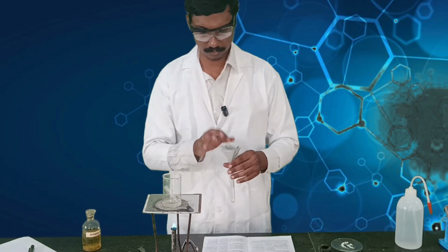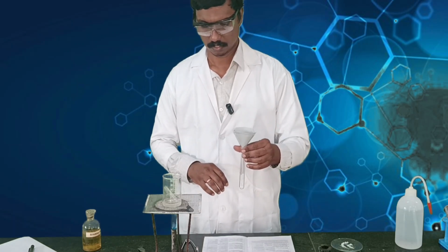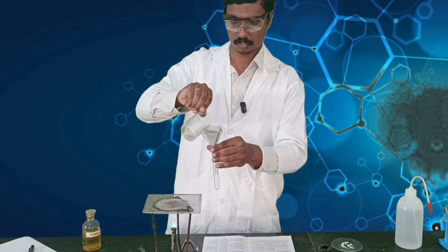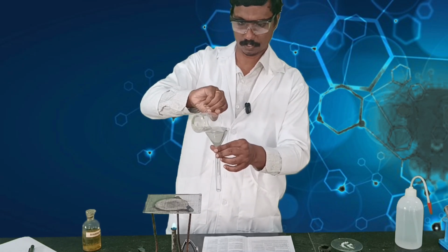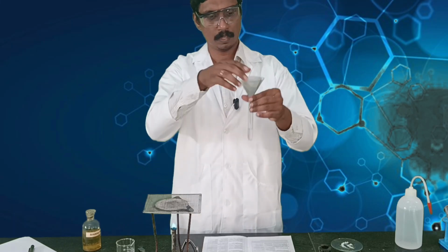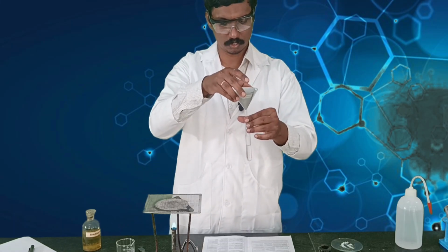And this filtrate is now collected. So use a filter paper to collect this extract, and the rest of the tests you will do with this extract.